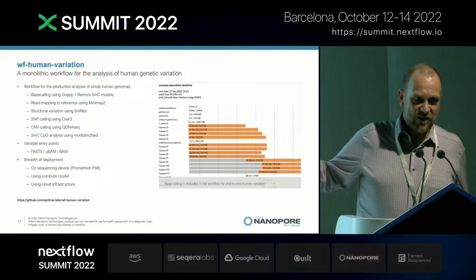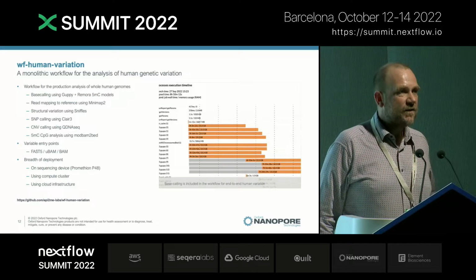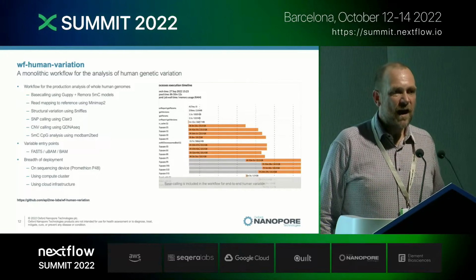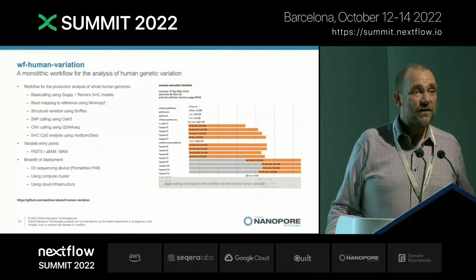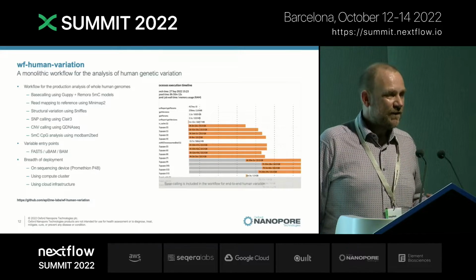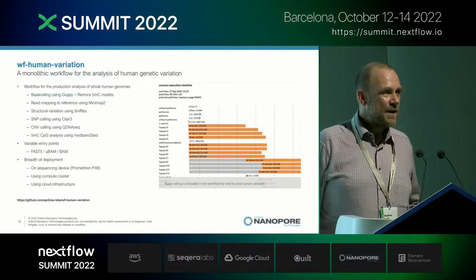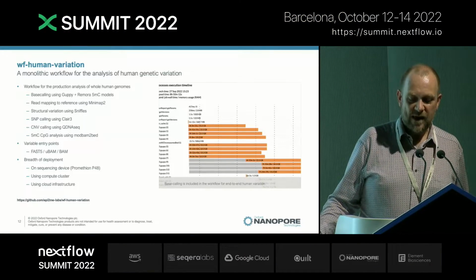Anyhow, this is the usual execution plot that comes from Nextflow. And this shows the particular analysis that we're running here. Here we're taking a deep sequenced single human genome. We've got long sequence reads, and what we want to do is perform both the base calling and variant calling all in a single process. The base calling of Oxford Nanopore sequence data is fairly complex. It involves machine learning, it involves neural networks, and it involves a lot of GPU. So we've got the challenge here of how quickly we can turn around the analysis of a human genome.